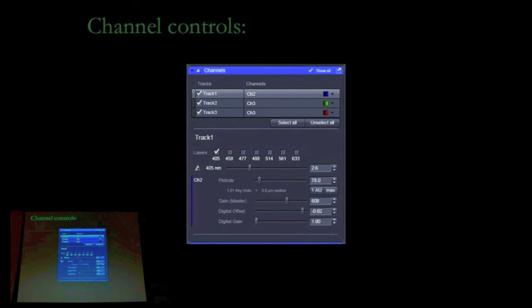Because what I heard is when you really do the scan, the best step, the thickness of the section, should be around half of the Z resolution. So yeah, if you were doing a Z stack, you'd want to set your step size to be half of this, because you need to sample that point spread function at least at the Nyquist rate, so at least twice, in order to be able to digitally capture the optical information. So we got the value from here, then divided by 2. That's right. To set your Z step size, correct?